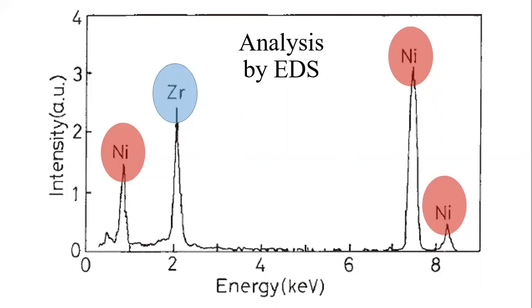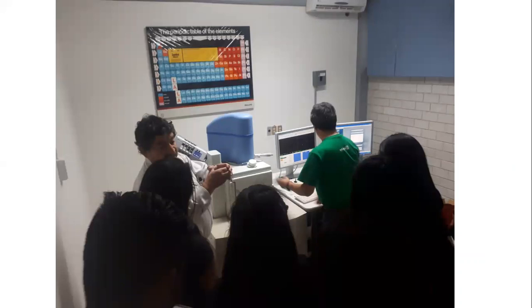Very interesting also, of course, the UTM was present on doing some of these experiments at the Instituto de Metalurgia. Okay, so take a look at this. This is when we went, and this guy is the chief of the equipment, and he was explaining to the students all that I'm explaining to you right now. And this is the equipment. It's not very big, as you can see. The one that is bigger is the transmission electron microscope. And as you can see, they have a little periodic table of elements.